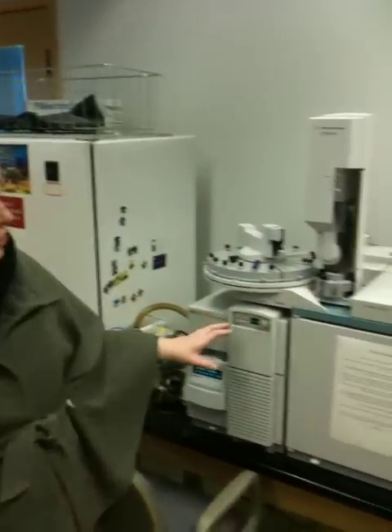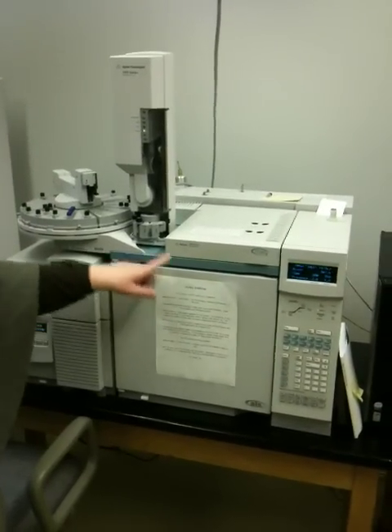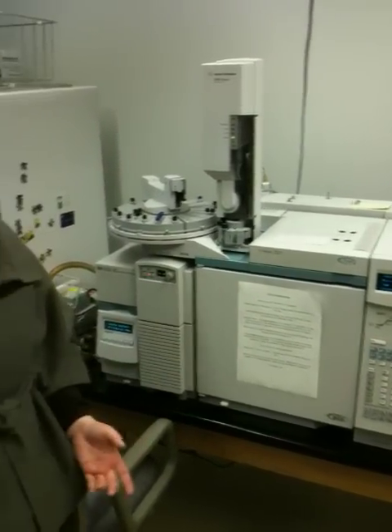This method can be used to determine the molecular mass of a compound. You might wonder: how do we know what the mass of a compound is? How do we know the formula of a compound today, in 2010? Back in the old days, they did combustion analysis. Now we usually do a mass spectral analysis. So the thing to take away is it's the same as what you've been doing: injection, but through a robotic process; separation on a column in an oven, very much like what you've done; but instead of just detecting the compounds with a thermal conductivity detector as we did in the fall, you're going to be detecting the compounds using a spectroscopic technique.